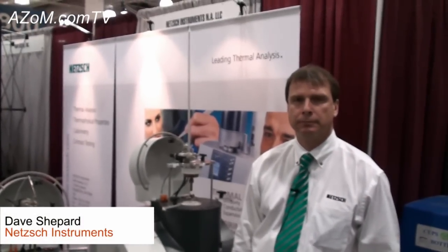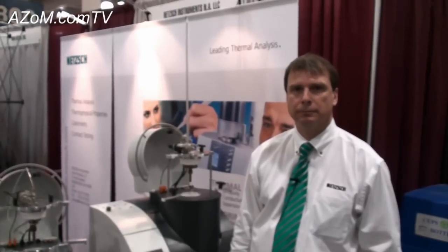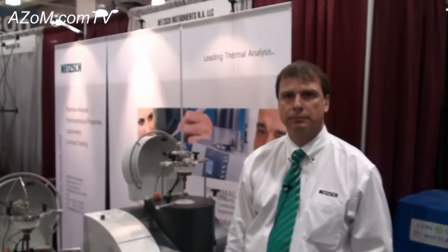This is Cameron Chai from Azom and I'm bringing you another episode of Azom.com TV. Today we're speaking to Dave Sheppard from Netzsch Instruments and he's going to talk to us about the MMC274 Nexus multi-module calorimeter.